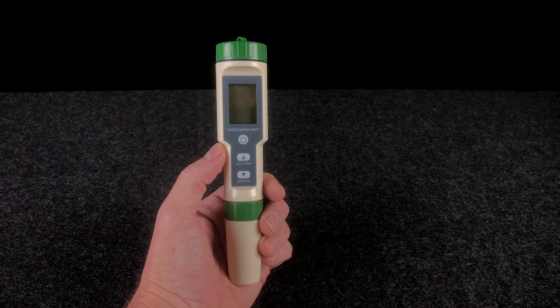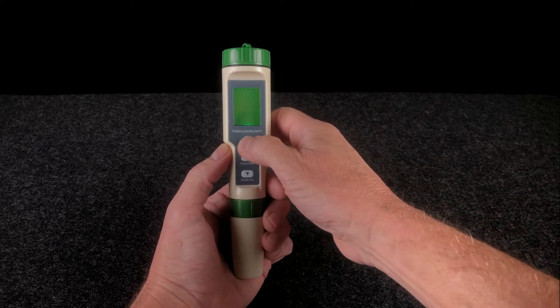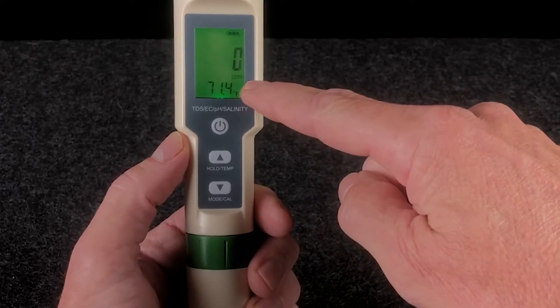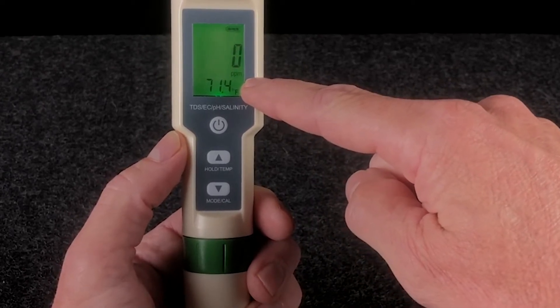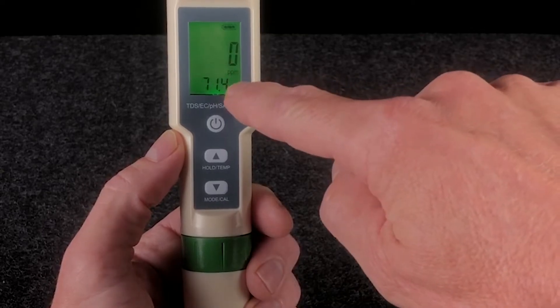So let's go through some of the operating modes for your new meter. When you first turn on your meter, you'll notice that you're in whatever mode you were in the last time you turned off the meter. In this case, we're in TDS mode, and I know that because of the PPM that I see displayed on the display.